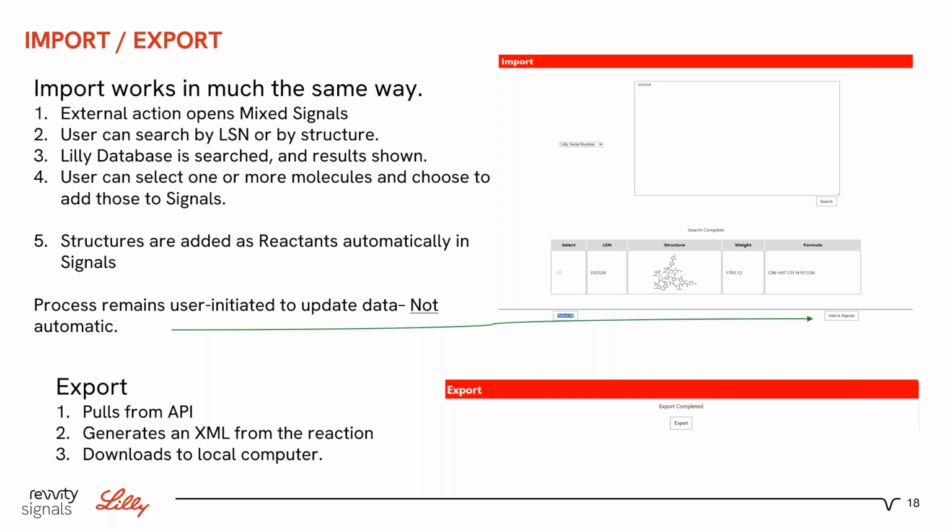It's a user instigated action, which will then push that via the API back into our notebook page. And so in doing that, we can select any of these and it actually pushes it back as a reactant automatically.